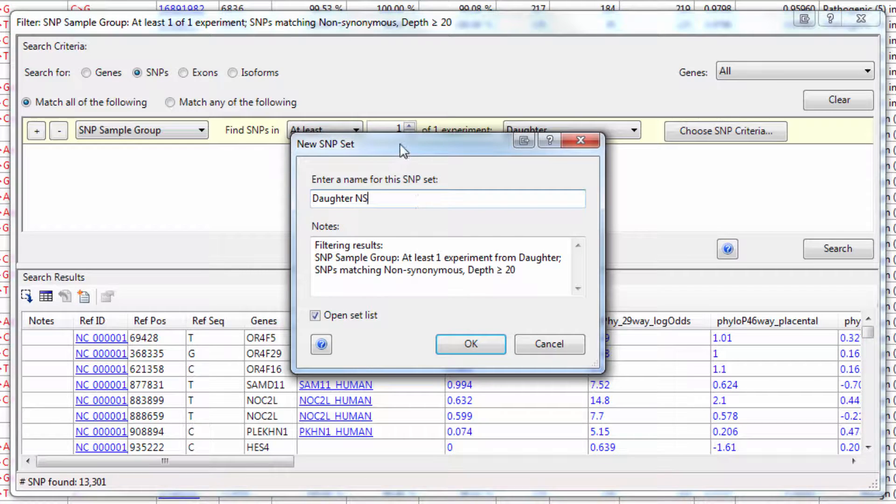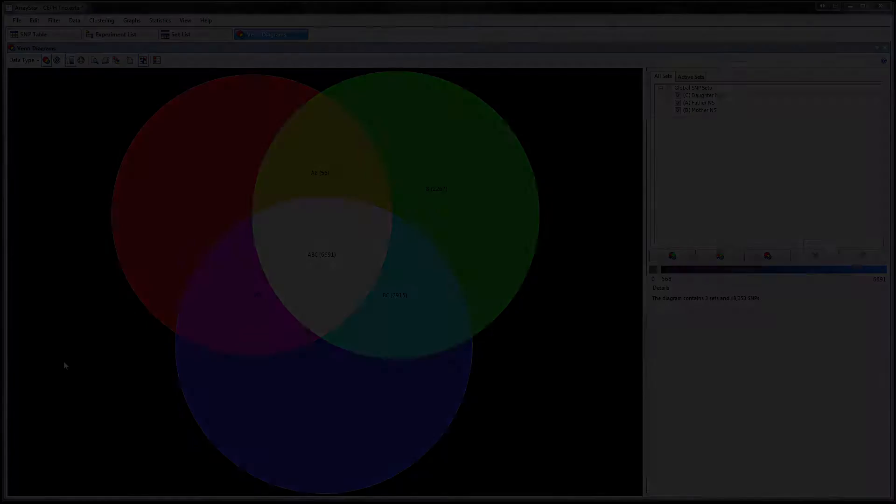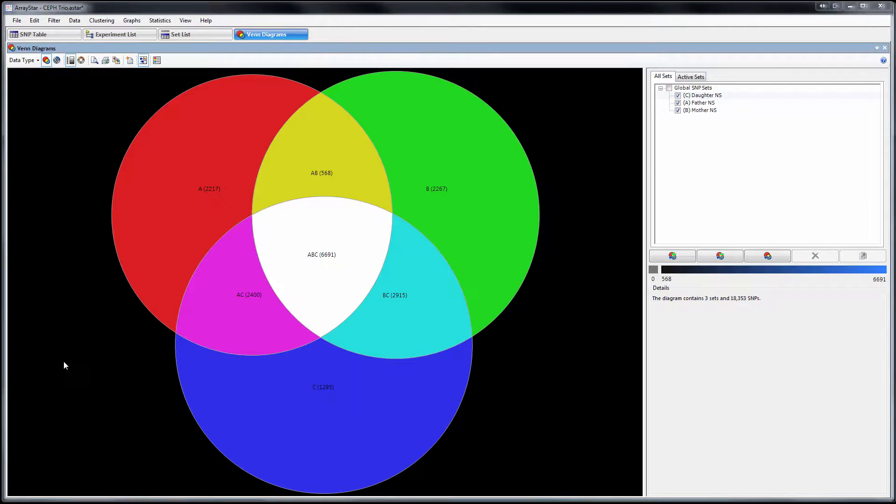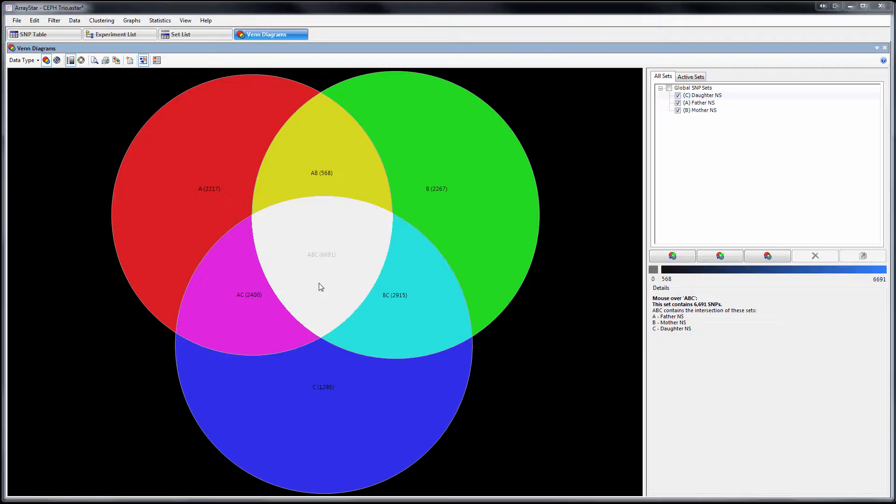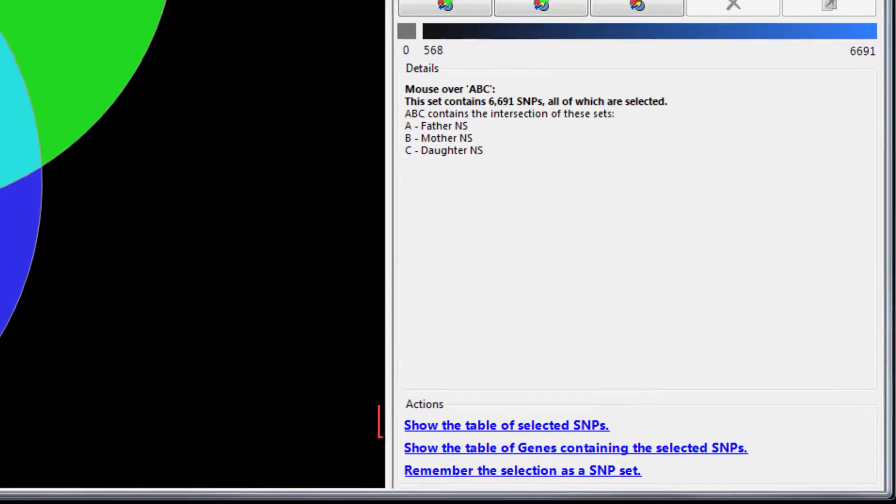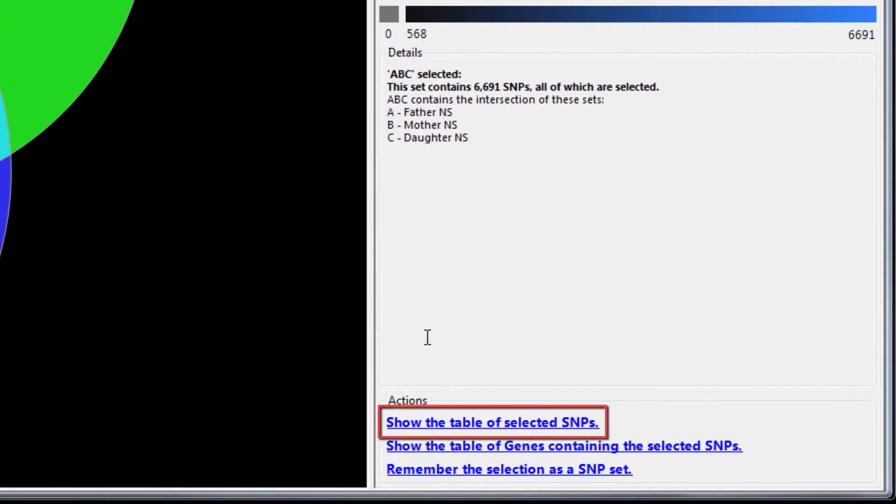I can then repeat this search for my other samples. I can then compare those SNP sets in the Venn Diagrams view. So here I can easily see what SNPs in the daughter are shared with the mother or father or both parents. I can then select a subset here and view those variants in the SNP table.